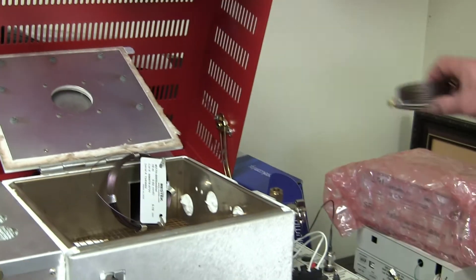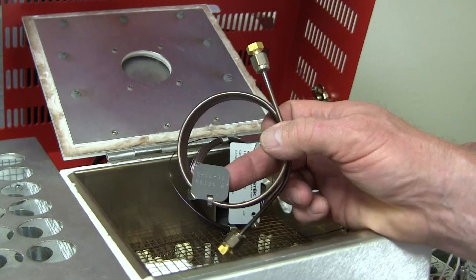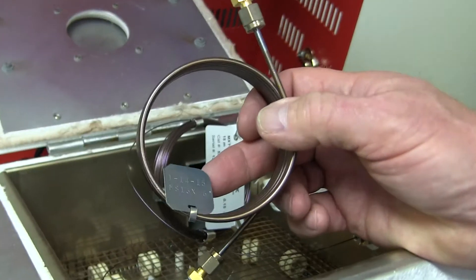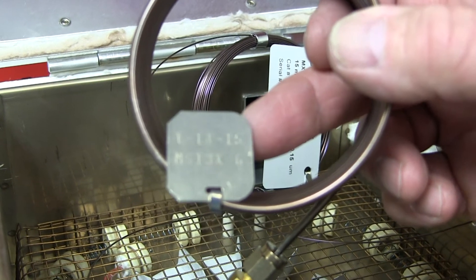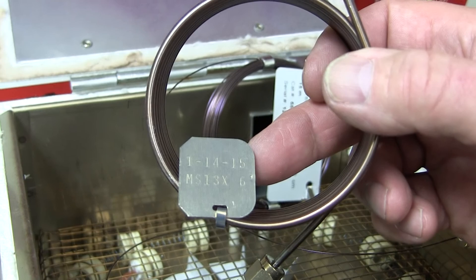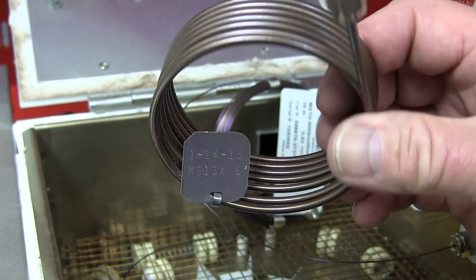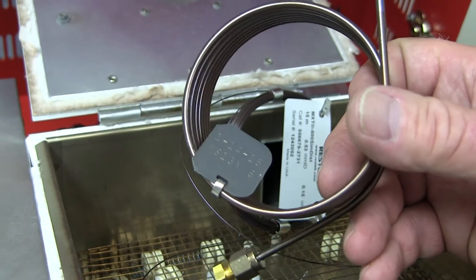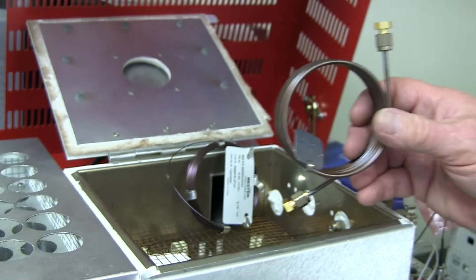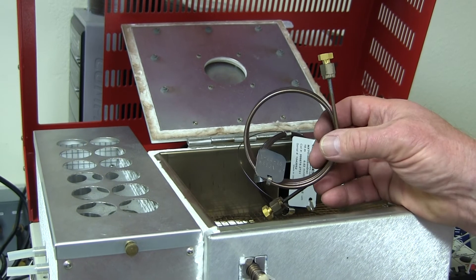A packed column like this has particles of material inside. This particular one is a molecular sieve 13x column and it has a temperature limit of at least 350 degrees centigrade, so hard to really heat this one up too hot. But there are many columns, especially these older packed columns, where the temperature limits are only 150 degrees. So you have to be careful not to exceed the maximum temperature, otherwise you'll definitely damage the column.